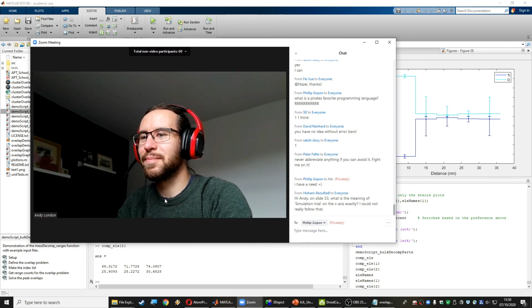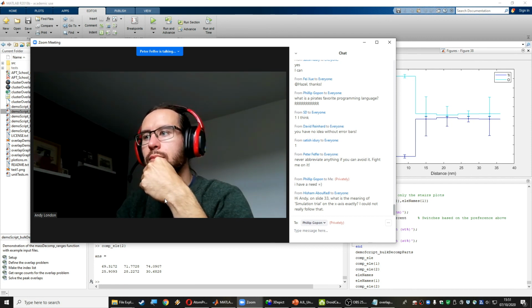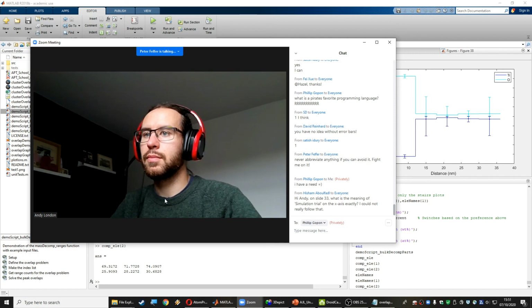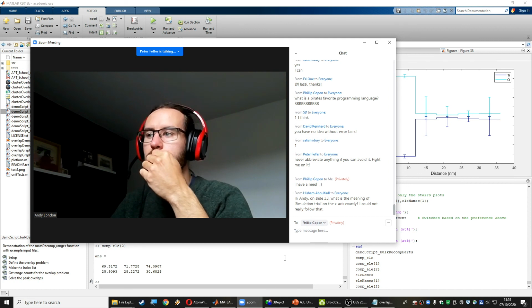Yeah. And it actually would be really interesting to integrate, because I think we've provided quite a fair bit of the infrastructure that's really going to make it shine, especially in terms of pre-guesses. So you could, for example, define a lot of ions and then go like, okay, these are all my potential candidates. Please give me a good estimate of what actually would make sense. And probably you'd have to make your physically educated choice of which one you would actually select out of those choices. And of course, the concentration determination that follows on with those estimates would also be really interesting to integrate.